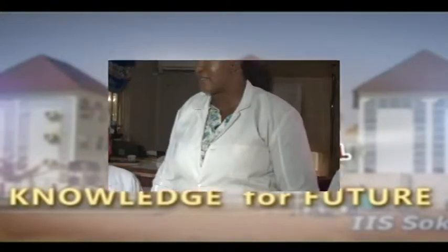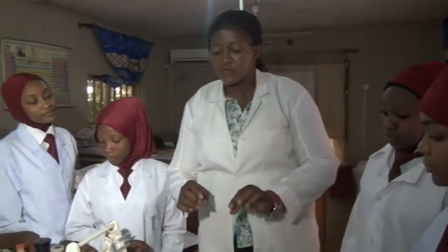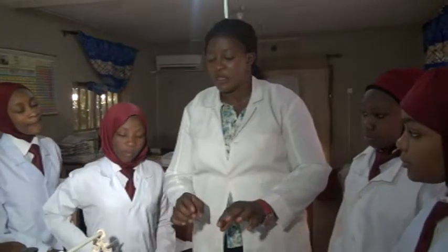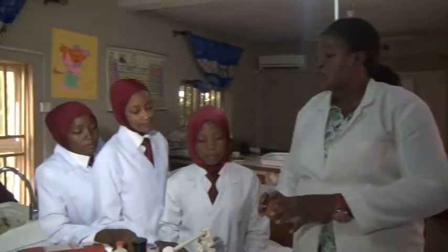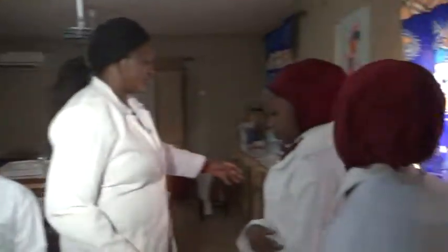Good morning, students. Good morning, Iman. Today we are going to be introducing you to some of the apparatus in the lab, and then we'll conduct a simple practical to distinguish between acids and bases using different indicators. So we are going to start with the introduction of the apparatus and reagents we have in the lab. So let's start from this point.